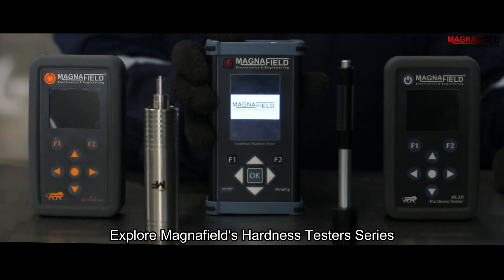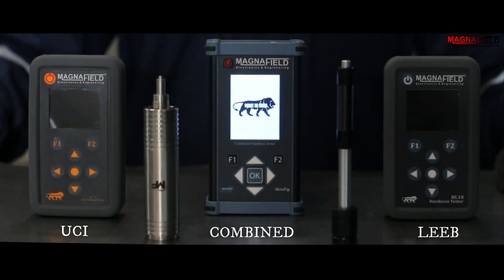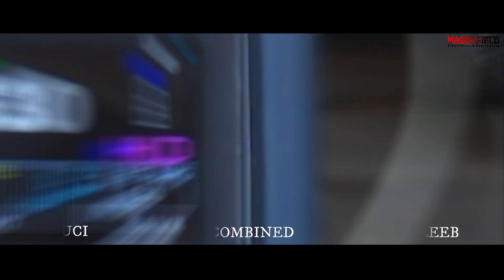Discover Magnafield's range of hardness testers, including the UCI Hardness Tester, Lieb Hardness Tester, and Combined Hardness Tester. For more information, visit Magnafield's website.